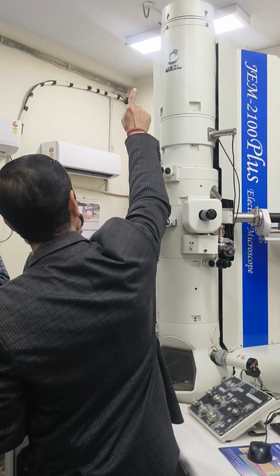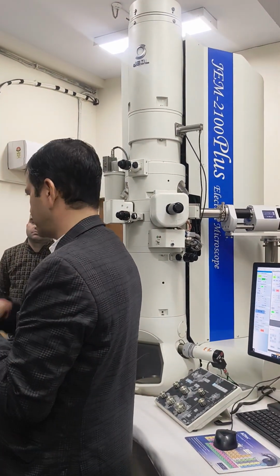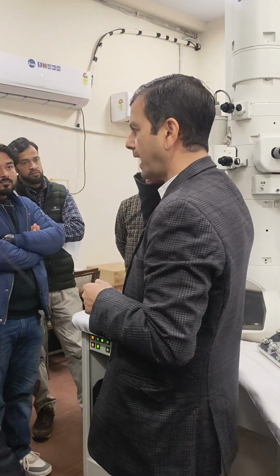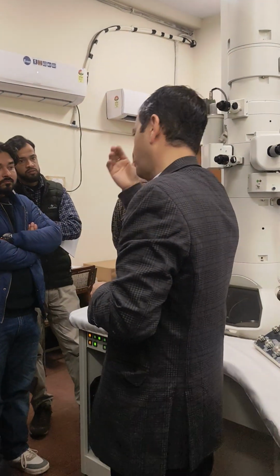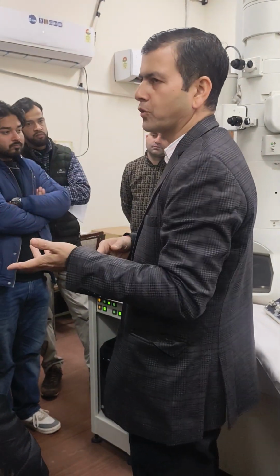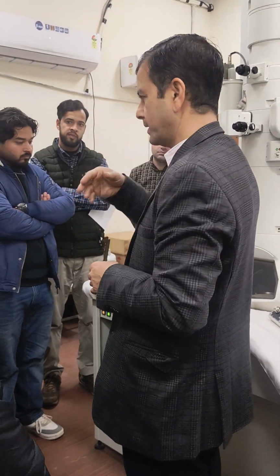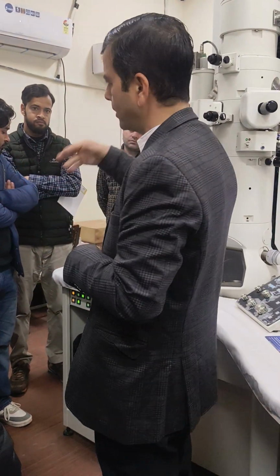Layout wise, at the top we have the electron gun. Basically it is a reverse of light microscopy. You first need to understand light microscopy, then the concept of electron microscopy came. If you go into the history, resolution was a challenge because they were seeing through visible light and were not able to see in much depth. So the concept of an electron source in place of light came. They did a lot of work. From 1935 it took until 1982 to get the Nobel Prize in this. Things took time.